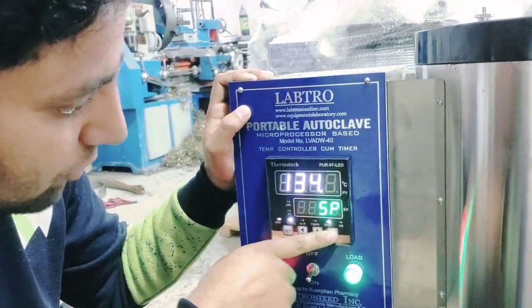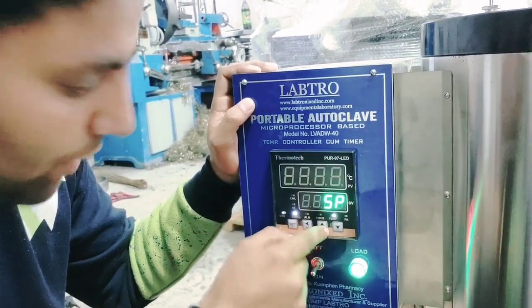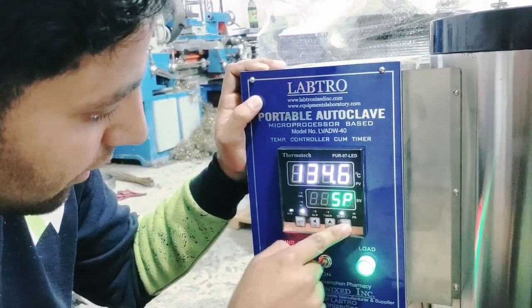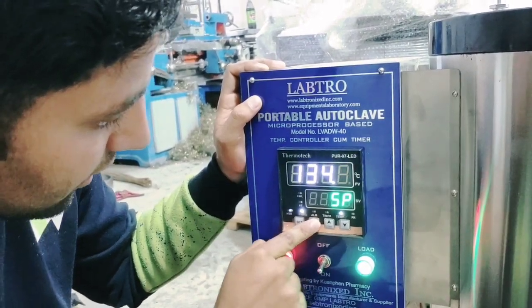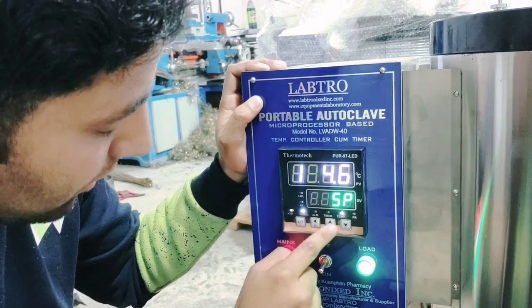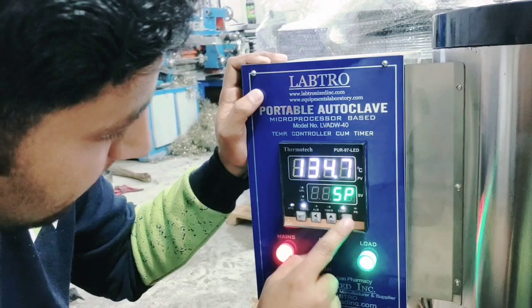So we will start the first step, then we will add 120 — we will add the same amount here. We will go fast, then 120, 120.